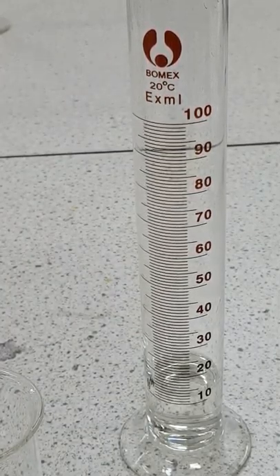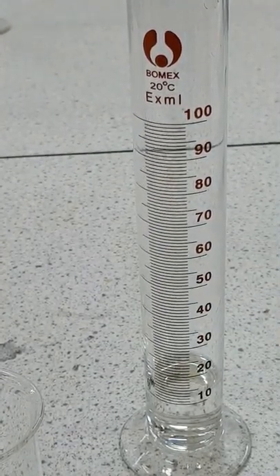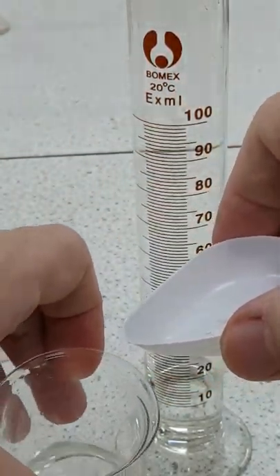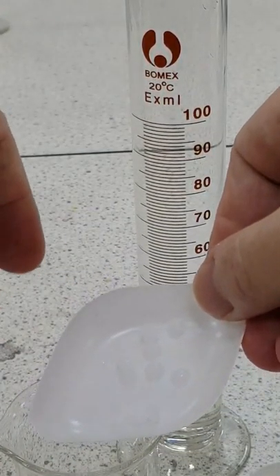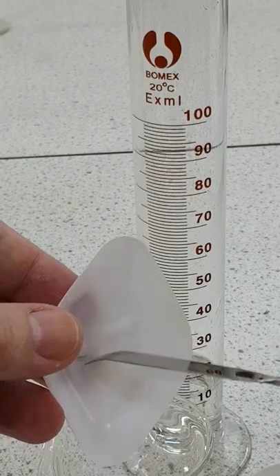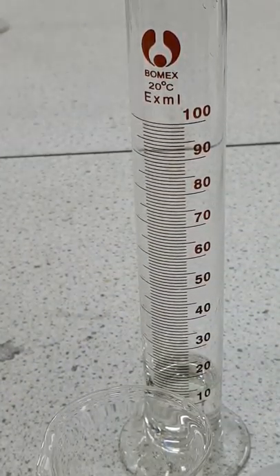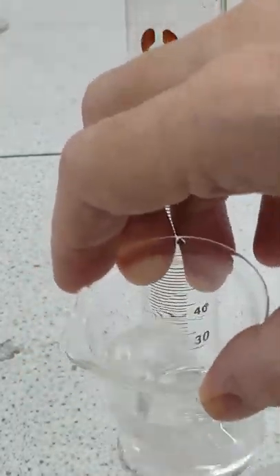Into that we're going to dissolve 0.15 grams of luminol, which I've already weighed out. We're also going to dissolve 1 gram of potassium hydroxide, so let's dissolve the potassium hydroxide first as it may take a little longer — it's slightly hygroscopic so it's stuck to the weighing boat. Make sure it all goes into the sugar solution. It is of course a very strong alkali and corrosive, so be quite careful. We're stirring — it's quite quick to dissolve.